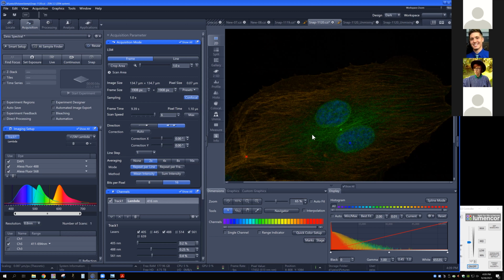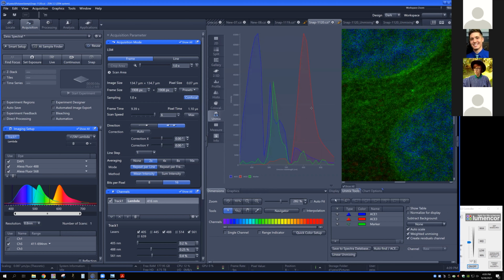Another thing to mention, going back to the topic of choosing different fluorophores that have optimal excitation and where you can collect a detection range that is suitable for the emission to collect as many photons as possible. That is absolutely true for all kinds of imaging, no matter what you're doing in spectral, and that is going to give you the maximum signal, the least amount of hassle and headache. In spectral imaging, sometimes you end up tuning and tweaking that a little bit as well.